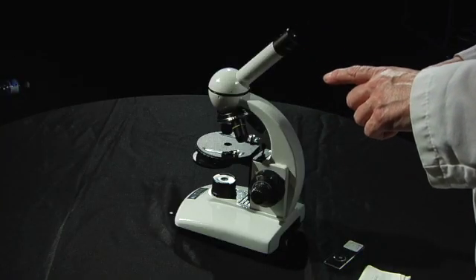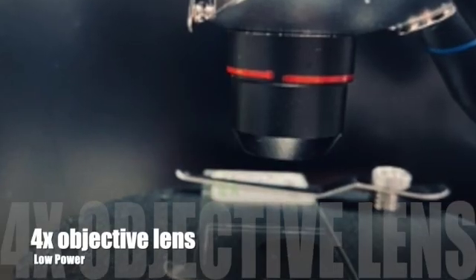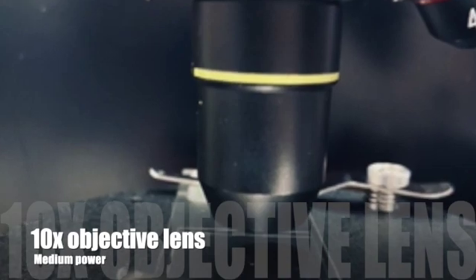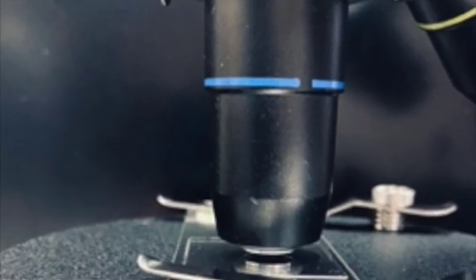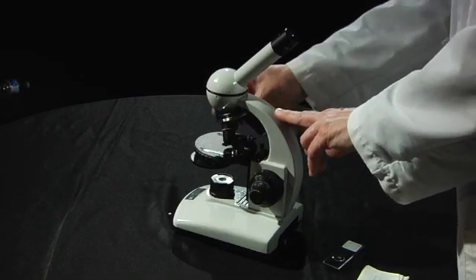Another thing about the rotating nosepiece and the objective lenses is they have different color bands going around them. This one has a red band — that's the low power, the 4x. This one has a yellow band — that's the medium power or 10x. And this one has a blue band and that's high power. So if you can't see the numbers when you're looking at a microscope, you will be able to see the colors.